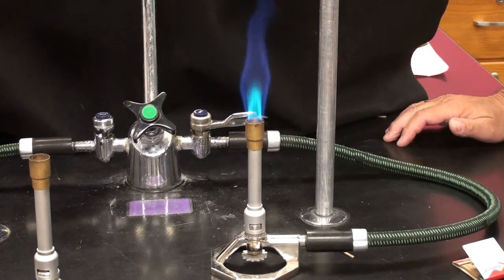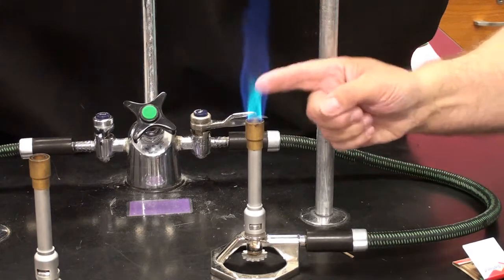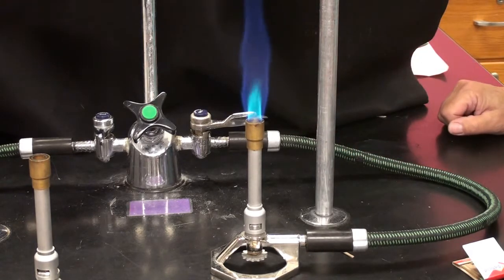So this is one of the characteristic flames of the Bunsen burner, right? If you look at it, they've got a kind of an outer cone over here. You can see an inner cone there. That's kind of what you want, right? If yours doesn't look like that, though, you have to be able to adjust the flame.